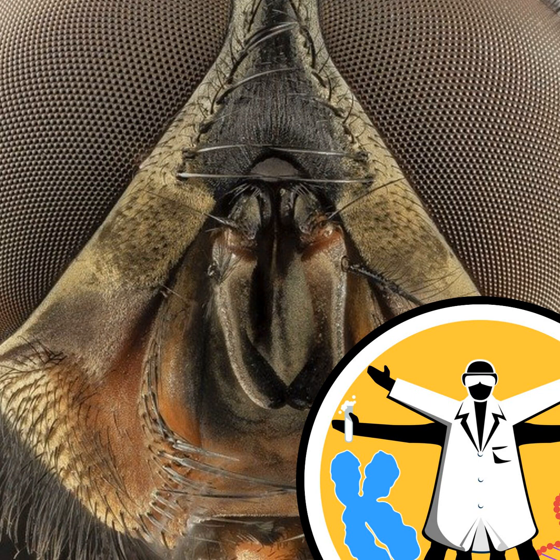So we suspect that there could well be some false positives in there. And this is what has this fly been eating? So this is a bit of a cautionary tale about using metagenomics. The method uses some reasonably complex bioinformatics to try and fit things. You're looking at very small fragments of DNA and trying to align them against wider genomes.